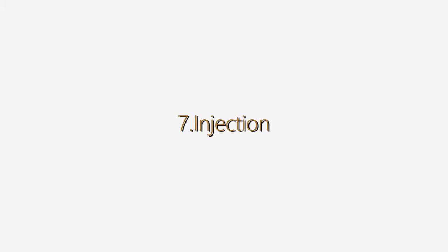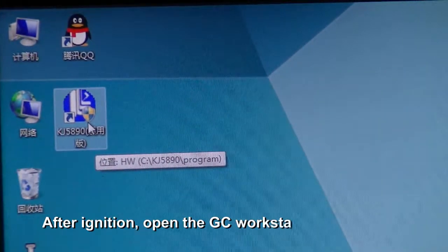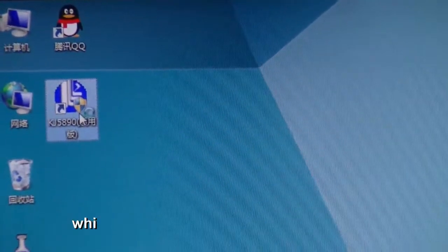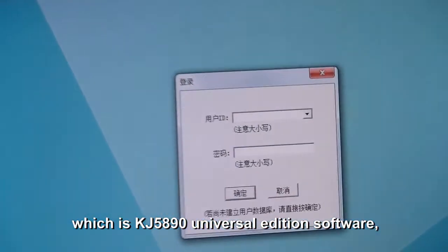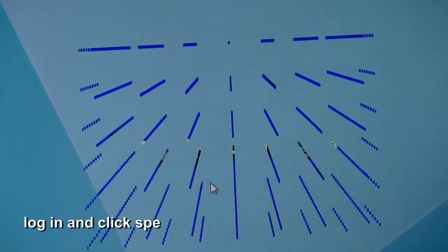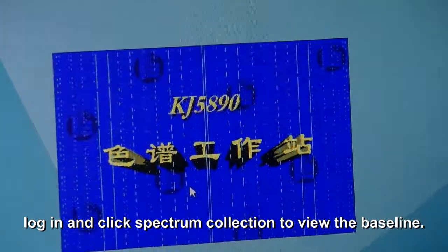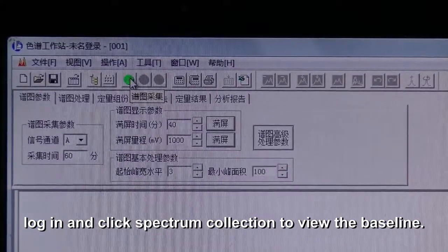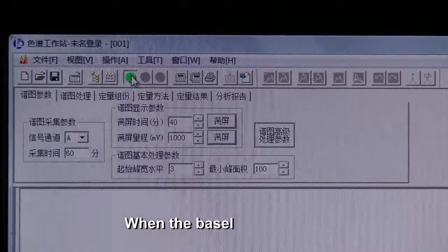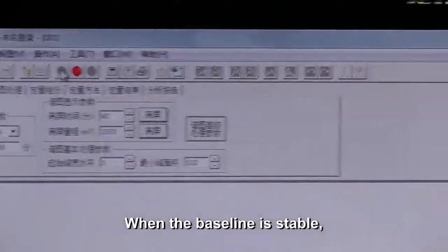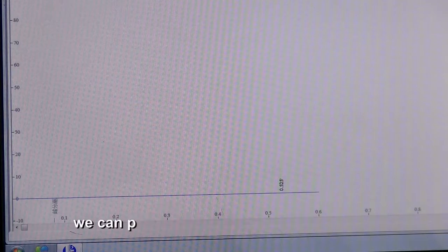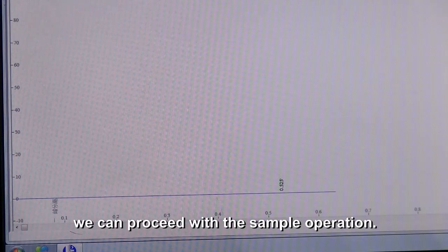Injection. After ignition, open the GC workstation, which is KJ5890 universal edition software. Log in and click spectrum collection to view the baseline. When the baseline is stable, we can proceed with the sample operation.